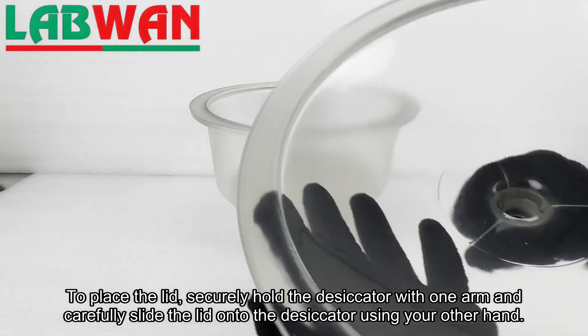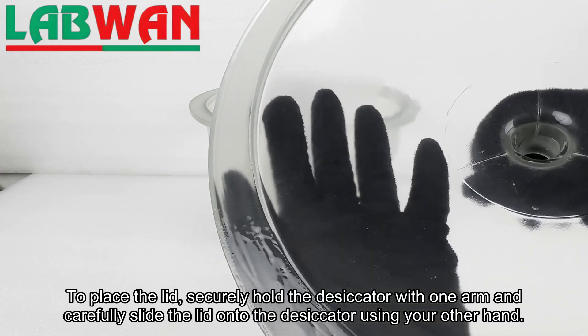Hold the desiccator with one arm and carefully slide the lid onto the desiccator using your other hand.